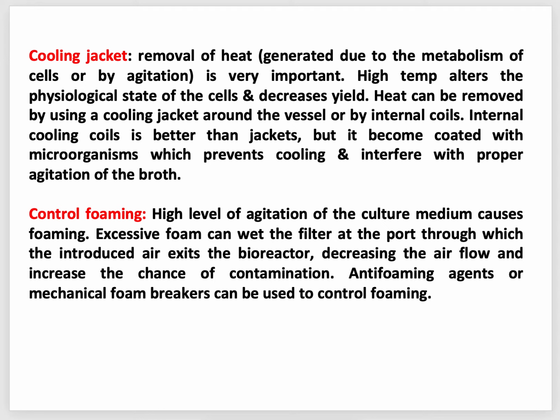One thing can be done, right? We can directly use a cooling coil. If you put some cooling coils inside the fermenter, which are also called internal coils, they could easily cool down the media. But using cooling coils has a problem. If we use internal cooling coils, these coils can get coated by microorganisms, which will prevent the cooling and interfere with the proper agitation of the product. So that's why, although internal cooling coils are better, instead of internal cooling coils, cooling jackets are used.